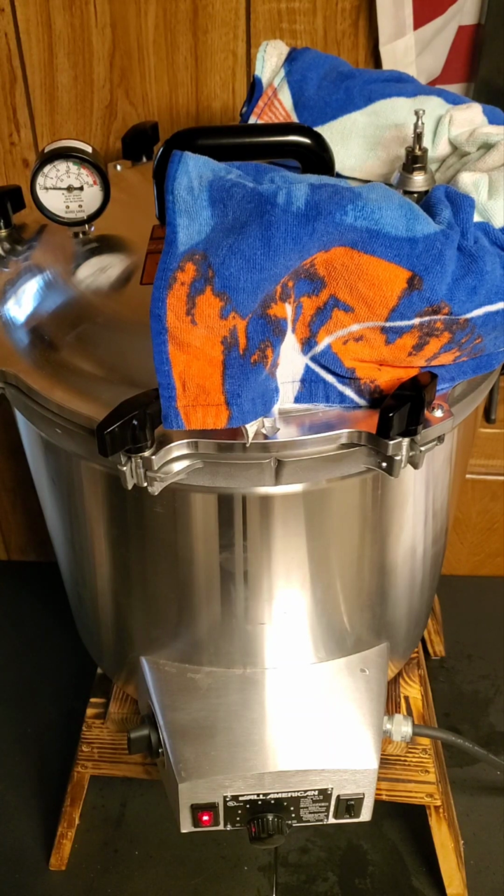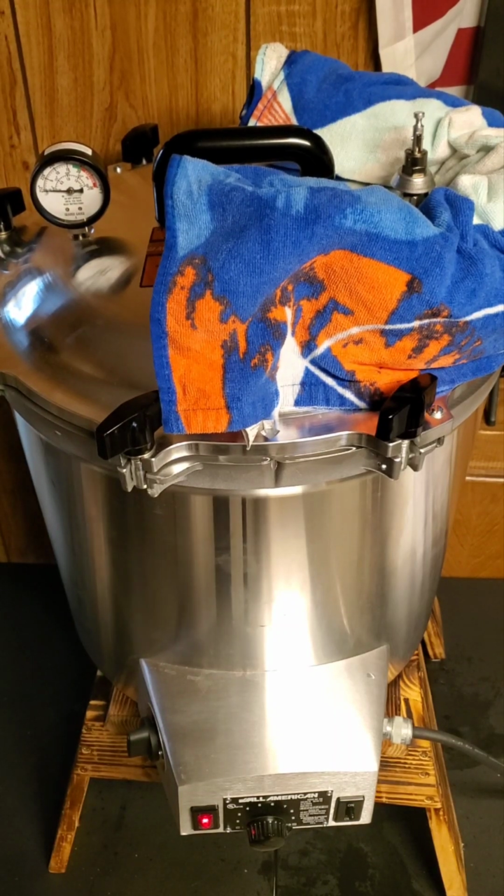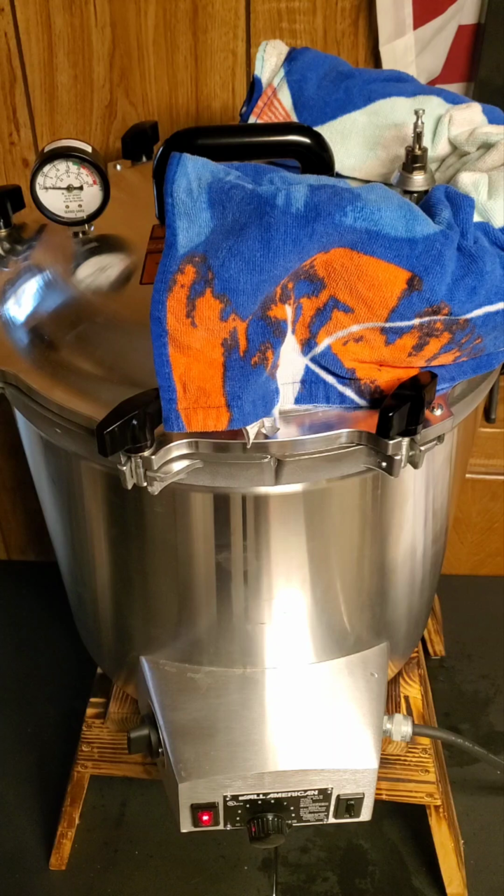There are reasons to do that, but with these bags, I'm not gonna do that. We're gonna just air this out for over five minutes, and then we're gonna cook it for 2.5 hours at the temperature, with the temperature being the most important thing for the sterilization here of this grain spawn, I believe. The factory recommended settings say bring it up to 15, then vent it back again, and there's conflicted results. Until I have issues, I'm probably not going to do that.